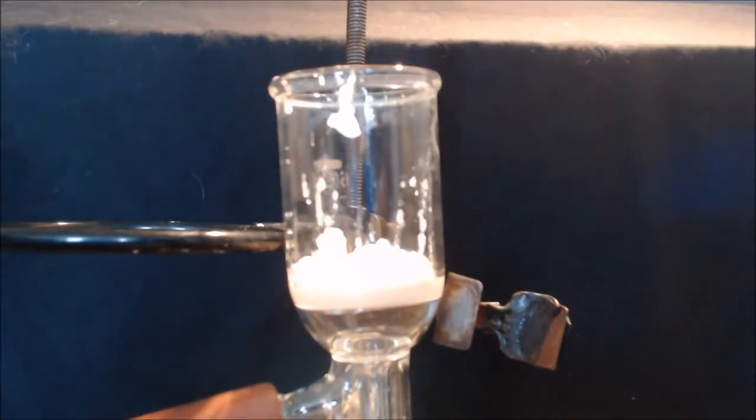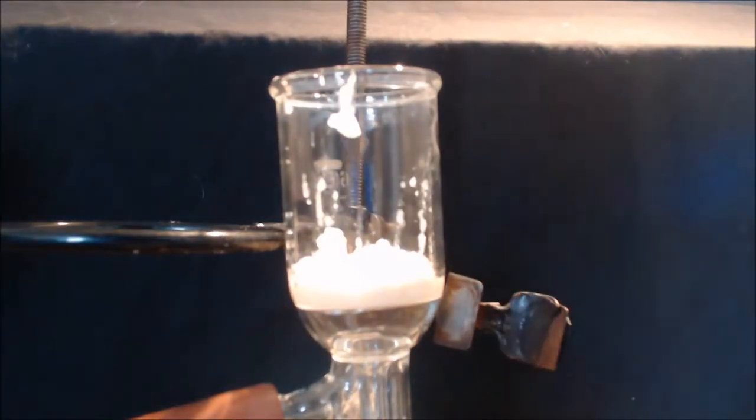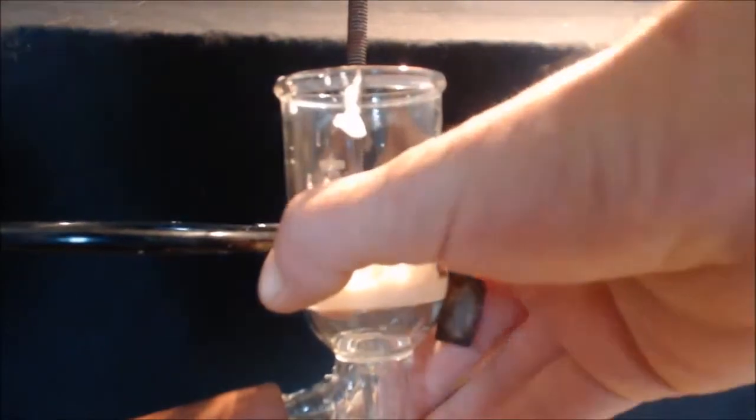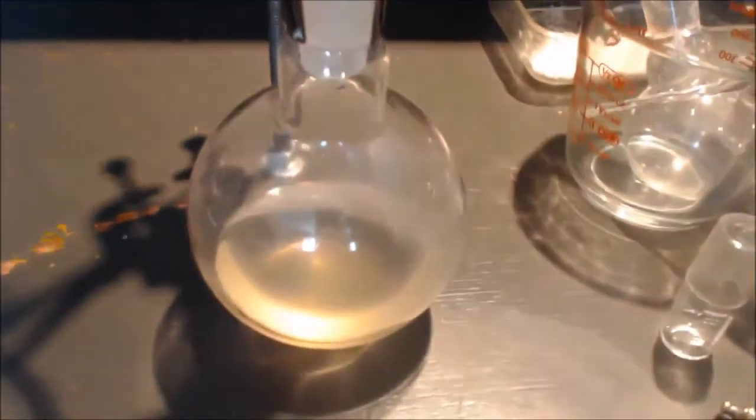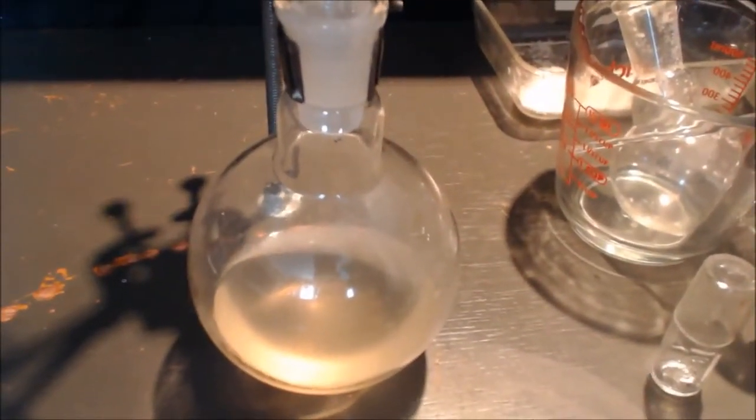As you can see, I got the last bit of potassium carbonate on there. I'm going to suck it through dry. We'll evaporate that ethanol off and dry that up and weigh it up. There's your potassium carbonate that I filtered out of the ethanol. 8 grams. Now here's the other stuff, most of the ethanol is evaporated, and that's what you're left with.